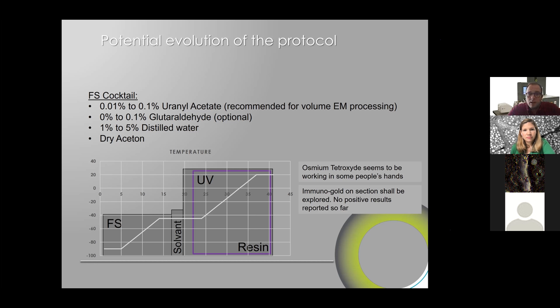As I mentioned at the beginning, the osmium tetroxide is not recommended. However, two weeks ago during the ZEISS meeting, I discussed with Paul Verkade, who told me that he used osmium tetroxide in the R221 resin, and it polymerized well, and he was happy with it, and he's looking into the results right now. So this is one thing that is about to be more widely known.